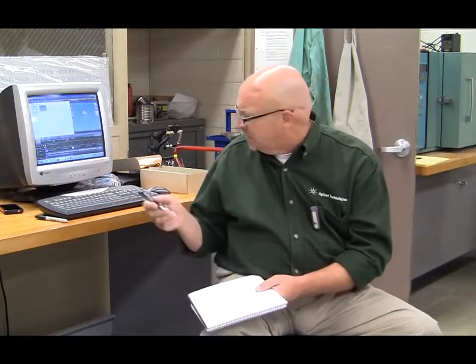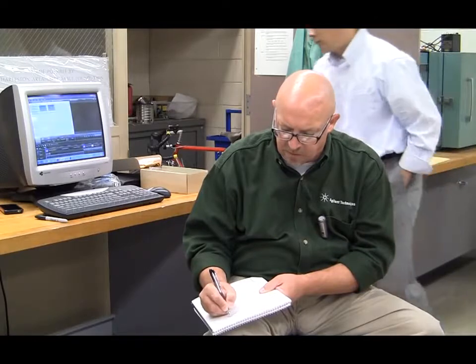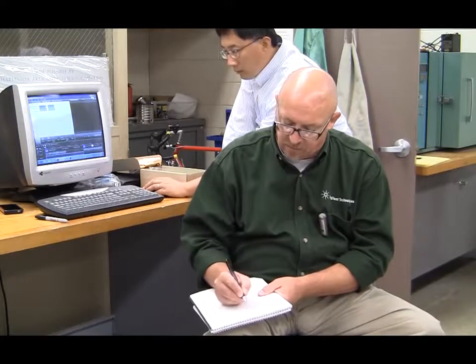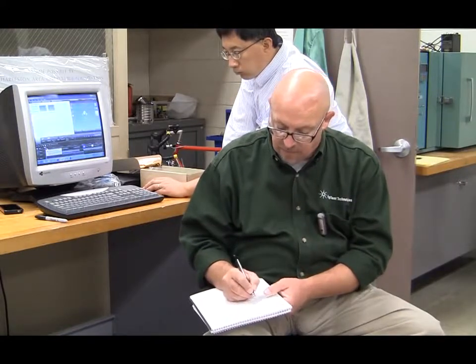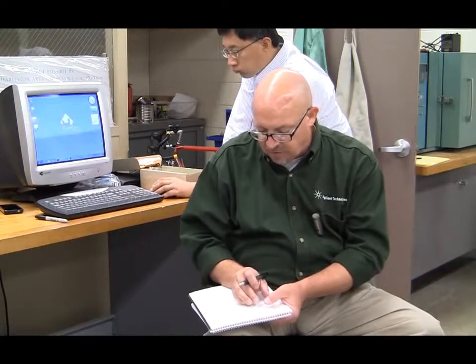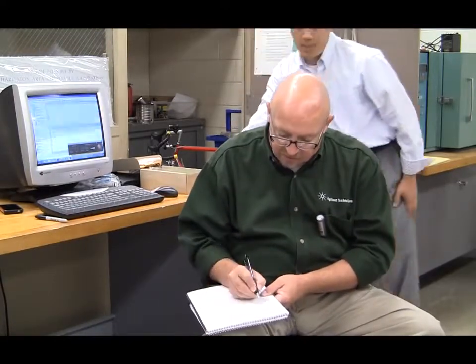I bring the carrier in, and I think, let's go with the mole sieve, the carrier's at 22 psi. And it comes into this. So there's a dilution effect. We're bringing argon in, and it's filling up this loop, which is atmospheric, to 22 psi. So if you think about your standard, it's being pushed towards the front, and then there's an equilibration step. It's gas, it equilibrates almost immediately. There's another thing that's set in the software called the inject time. We set that in milliseconds. And on this mole sieve, we're doing that for 40 milliseconds.